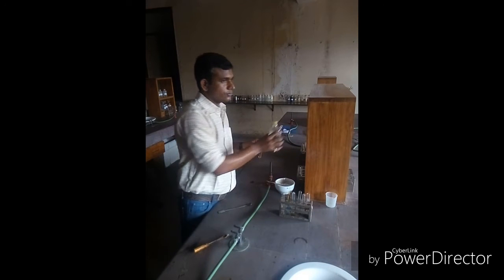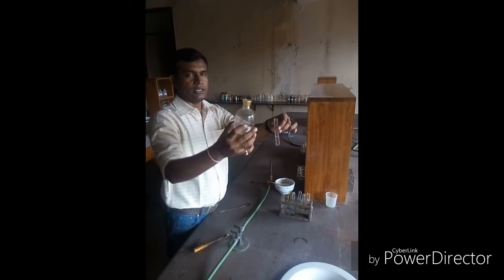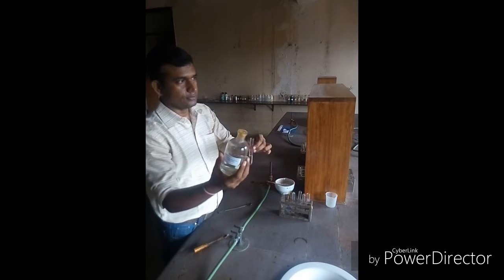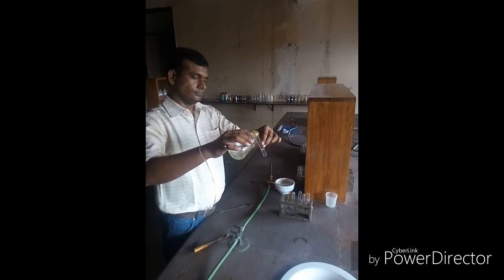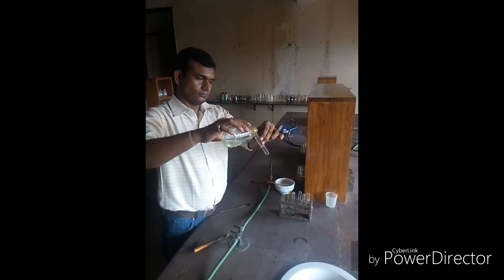In the quarter test tube of the original solution, add 2 to 3 ml of freshly prepared ferrous sulphate solution and mix it with the original solution.